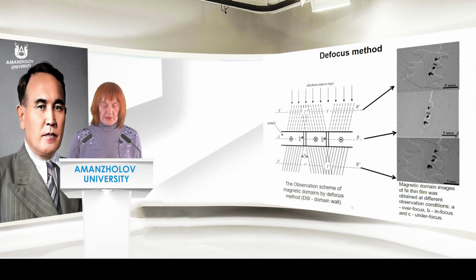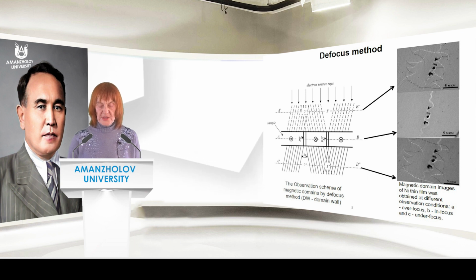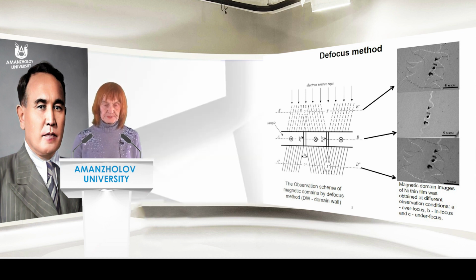In this report, we describe the capabilities of the conventional transmission electron microscope Hitachi HT7700.